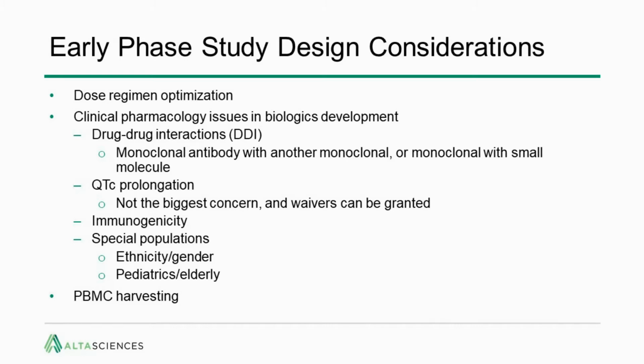for biologics drug development. And given the complicated, sophisticated biologics that are produced and the different effects that could occur in the human population, of course, there are different populations to consider, whether it's certain ethnicities with certain expressions of genes that aren't found in other populations, simple gender differences between men and women who may or may not express certain proteins that may be impacted by these biologics. And the age group of the population. How does this manifest, if at all, in effects and safety signals in the young versus the old? Is the efficacy different based on whatever genes are being expressed throughout the course of our life? What does that look like?